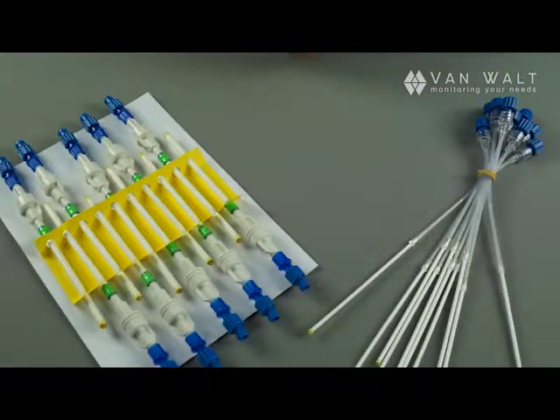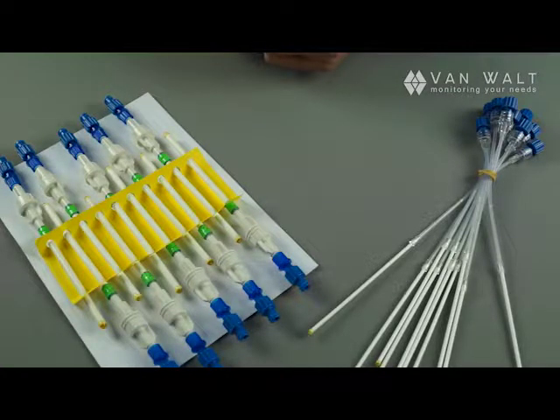There are of course many options to take soil solution samples which include ceramic samplers and Teflon quartz, but the rhizomes have certain advantages.